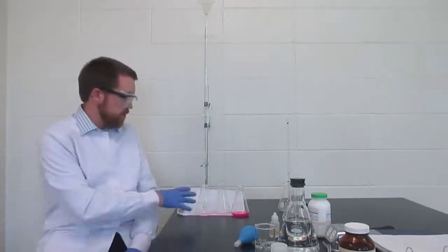This is what we want our samples to look like. It's nice that I actually had an example of an overshot one, even though I didn't try. But we've done the calculation, we've calculated the unknown concentration of our potassium hydroxide. The only thing left is to make sure you know what to do with the leftovers.